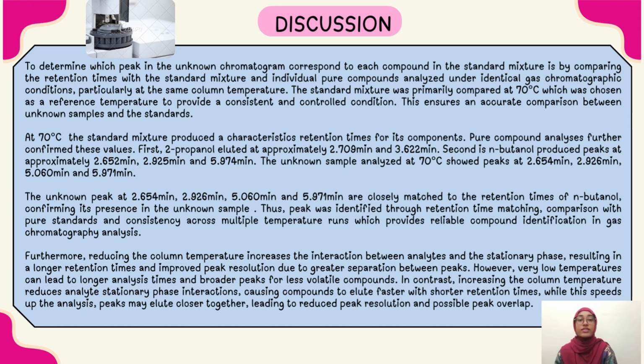At 70 degrees Celsius, the standard mixture produced a characteristic retention time for its components. Pure compound analyses further confirm this value. First, 2-propanol yielded peaks at approximately 2.709 minutes and 3.622 minutes. Second, N-butanol produced peaks at approximately 2.652 minutes, 2.925 minutes, and 5.974 minutes.